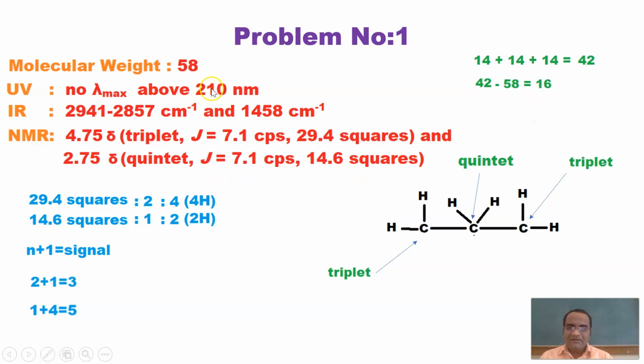So as per this data, the structure is almost complete, but as per the molecular weight we need 16 more, and there are carbons having only one bond on both the ends, that we should fulfill.